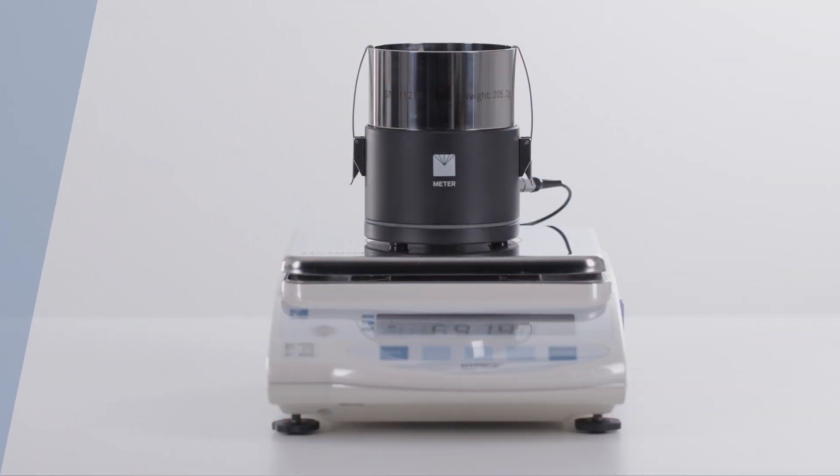The HI-PROP is a measuring system intended for measuring the soil moisture release curve and the hydraulic conductivity as a function of the water potential and the water content of soil samples.